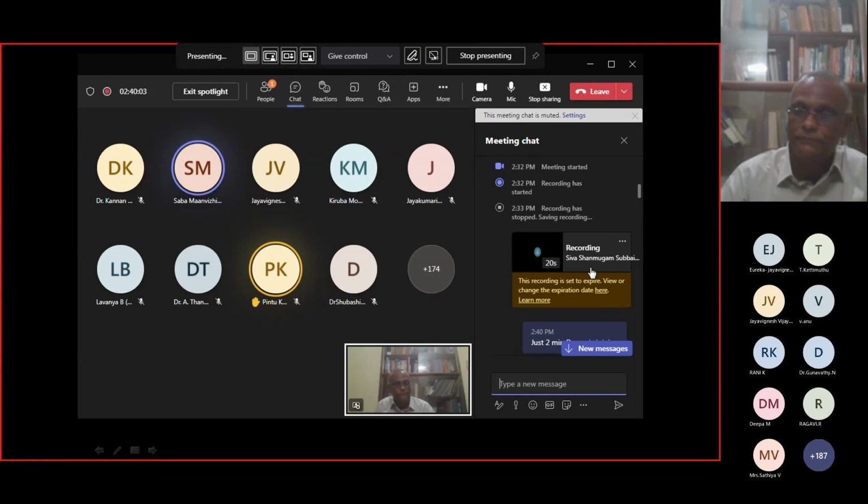Dr. Venkatraman sir from USA has replied to Ponmari's question, whether biological samples can be separated by TLC: many lipids can be separated using TLC. He has replied in the chat box.